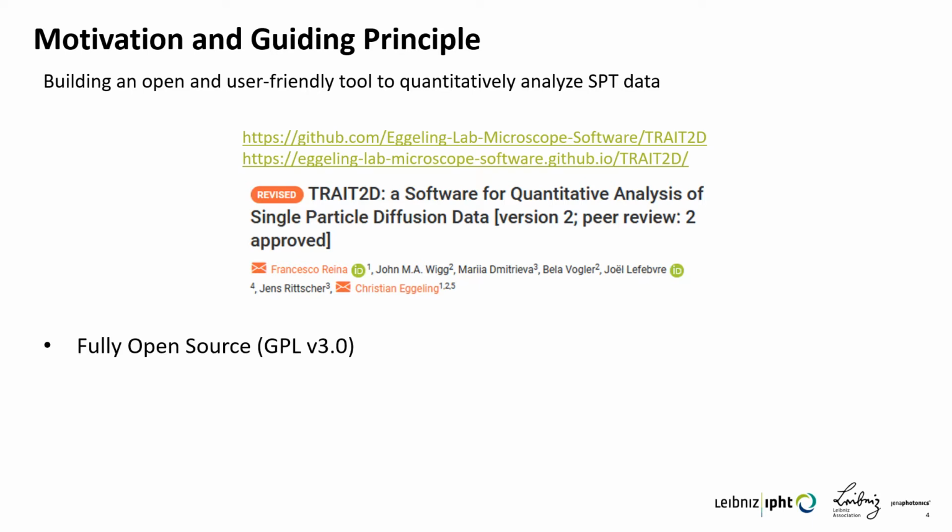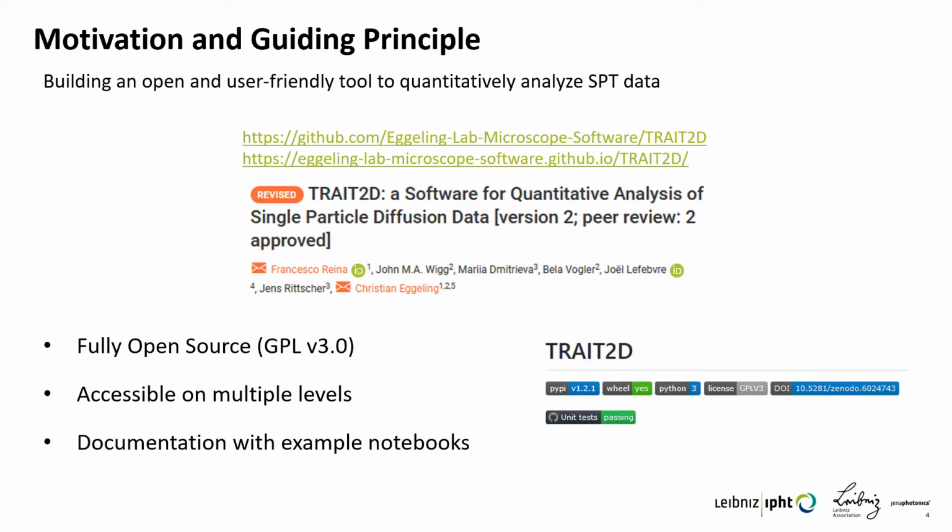And this tool is fully open source and is accessible on multiple levels from the side of the APIs, but also because we provided graphical user interfaces that would allow a less experienced user to take full advantage of it. And we provide documentation with example notebooks that can guide a new user to fully explore the extent of the capabilities of TRAIT2D.